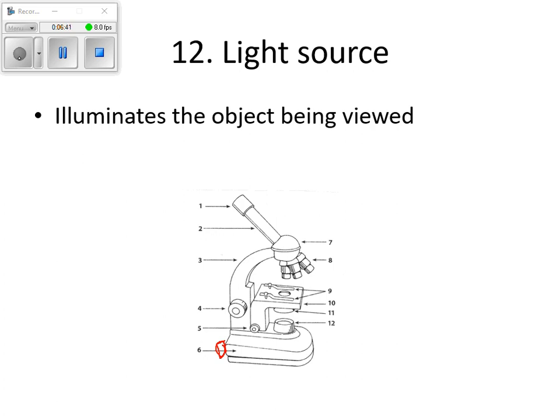First of all, if you plug it in, turn it on, and nothing happens or you don't see anything, there is another dial. I don't know what side it is on, I think it's on the other side. But there is a dial that you're going to see somewhere there, okay? And that dial turns up and turns down the amount of light as well. So the bulb is kind of like a dimmer switch. So there's a dial that you can roll. So I would say after you turn it on, if you don't see anything, try that dial to see if anything else happens, okay?